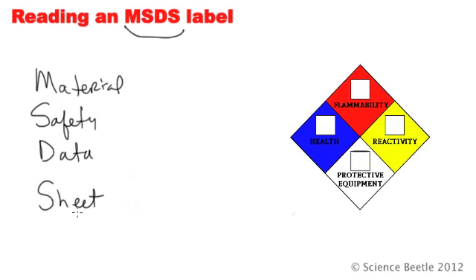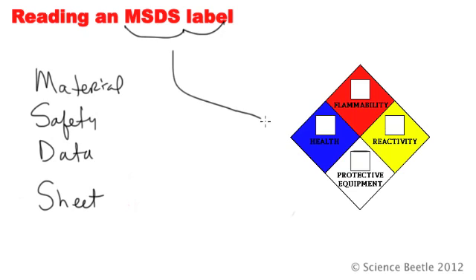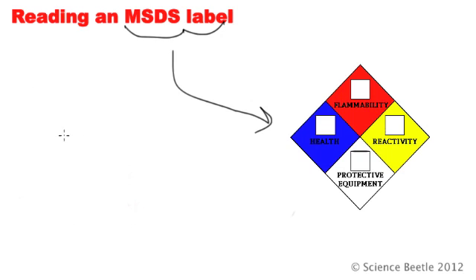I really urge you to look at the MSDS sheets that are provided in the chemistry classroom prior to doing any experiments in the lab, so that you know exactly how to handle those chemicals. There is also a shorthand version, which we call the MSDS label. This here is the actual MSDS label — an extremely small shorthand that gives you a very quick glimpse of what some of the hazards are going to be.